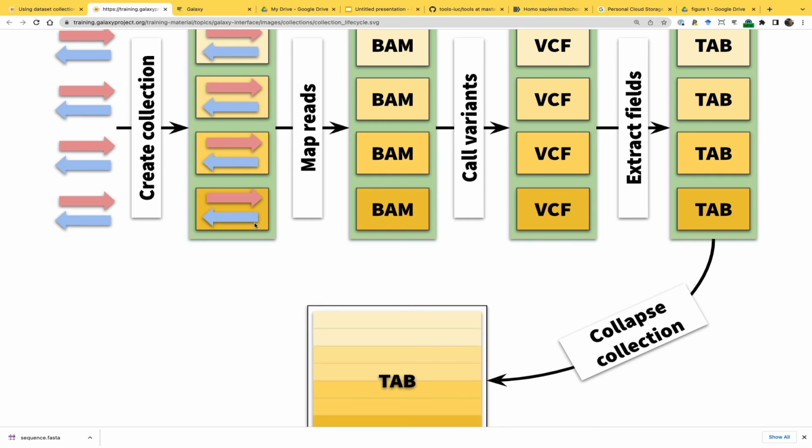But ultimately, I want to dump it in a single data set. So I can load it, for example, if I like Excel, I can export it to Excel. But I don't like Excel, so I can use it in Jupyter or in Pandas or in R data frames and so on. But you don't want 4 data frames, you just want 1 data frame.